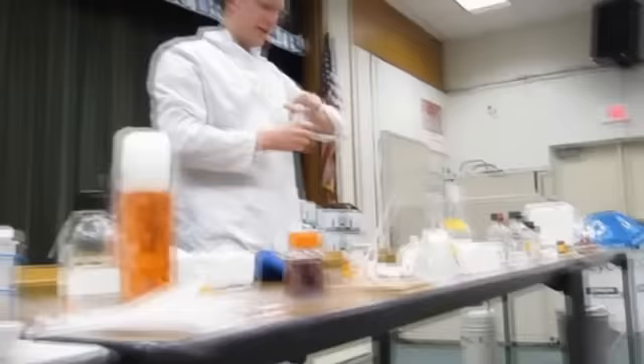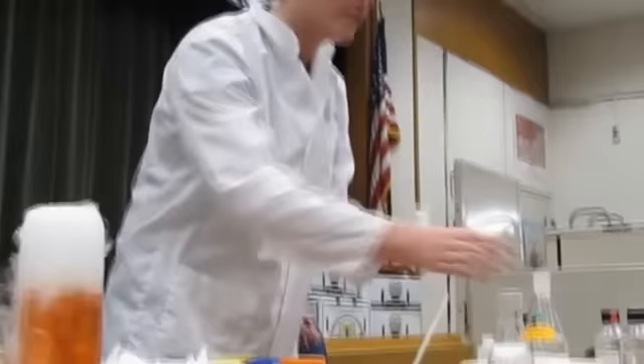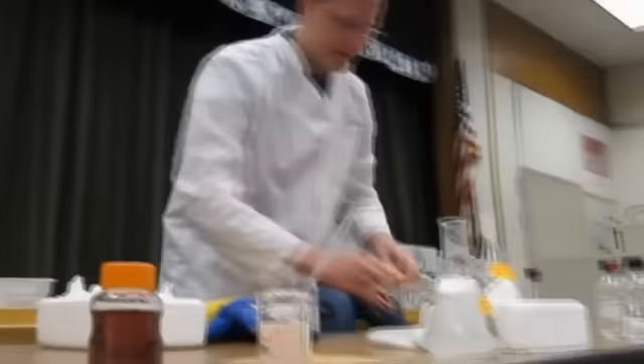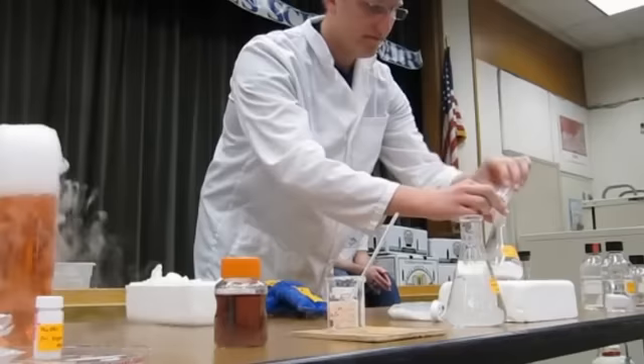Here I have some ammonium chloride. This is the same compound you can find in salty licorice — it's the salty stuff on licorice. It's actually an acid, a weak acid. I'm just going to dump it in here and then add some water to dissolve it.